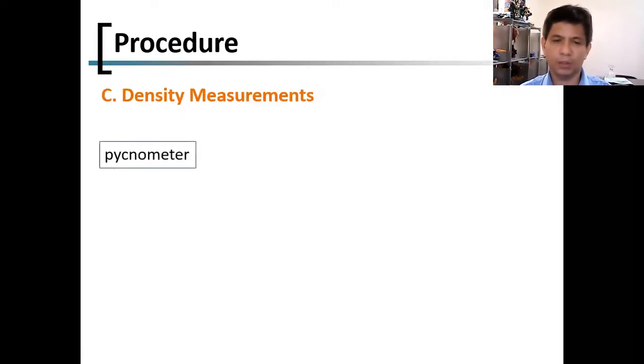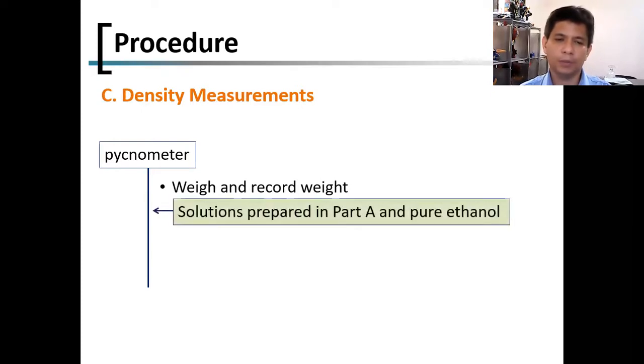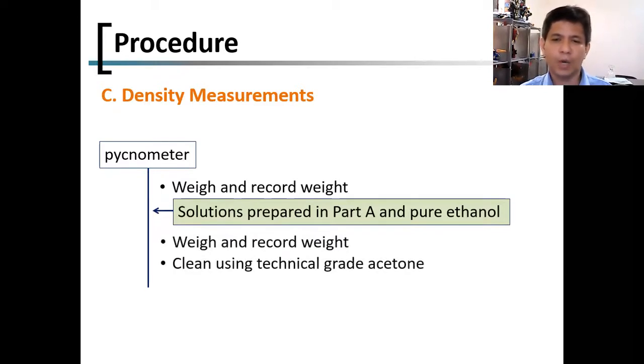Okay, so you have the pycnometer, tapos you weigh and record the weight of the pycnometer. Tapos you add the solution you prepared in the first part, or in part A, and also pure ethanol, kasi nagawa na natin yung water kanina, di ba? Tapos weigh and record the weight after placing the solutions and the pure ethanol. And then also you clean this using technical grade acetone.